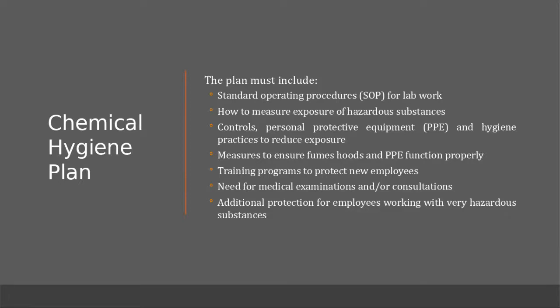You know how to measure the exposure of your hazardous substances. So using proper PPE, looking at using the proper equipment, like fume hoods, training programs. So as we mentioned, everybody's going to go through an equipment training. That's part of our hygiene plan.